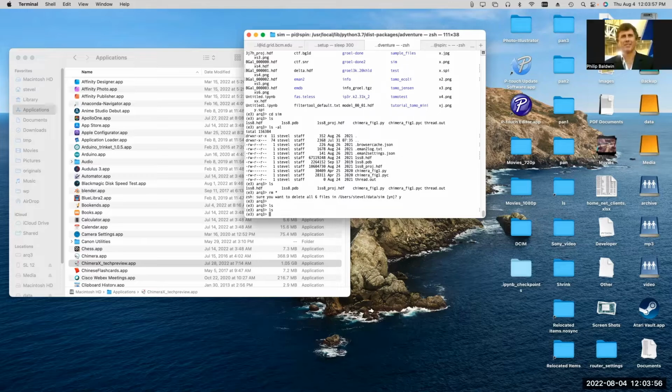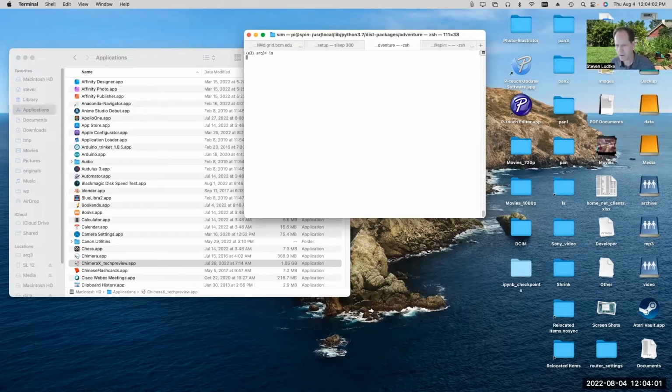Let's see. So I made an empty folder here that we could work in.